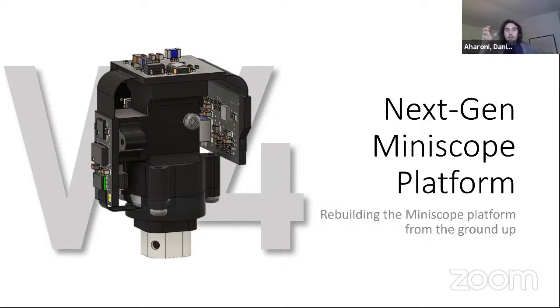Additionally, when you implant a GRIN lens, and sometimes with cranial windows too, there's an immune response of the brain tissue, which effectively blocks the fluorescence from getting into the bottom of the GRIN lens, and it takes a few weeks to clear up. So expression takes 2 to 4 weeks, and the inflammation response and clearing of the field of view takes 2 to 3 weeks, let's say. So you would want to time around those things.